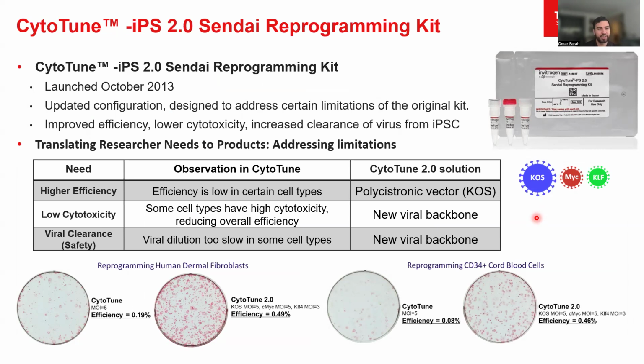We're going to talk about this later on as well, Angel, but you'll see that similar to what we talked about in terms of episomal clearing from the cells as time passes, we also don't want viral particles in our PSC cultures over time, right? So we look to generate a viral-free PSC line by the end of this protocol as well.